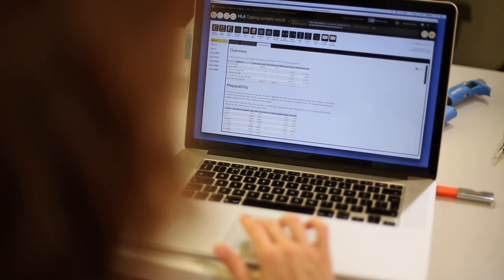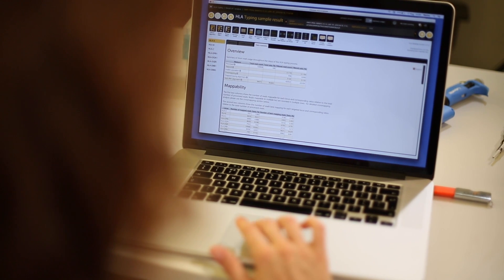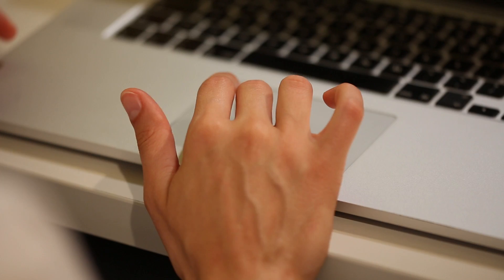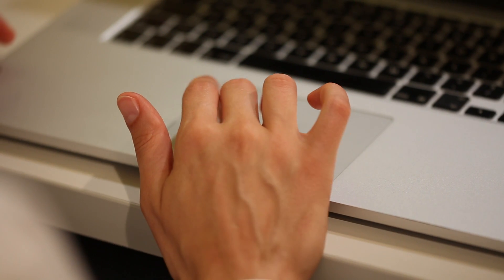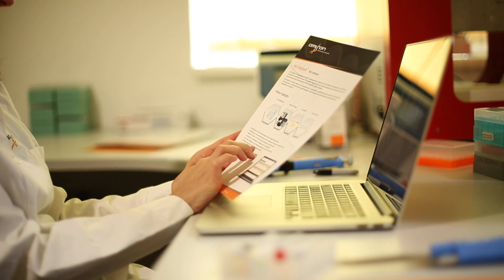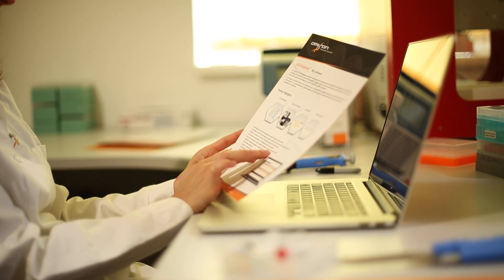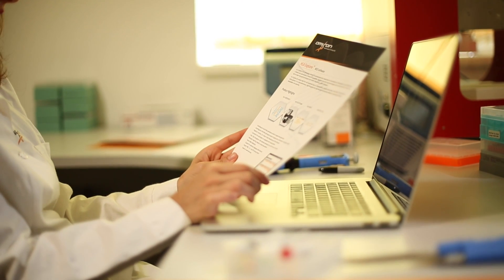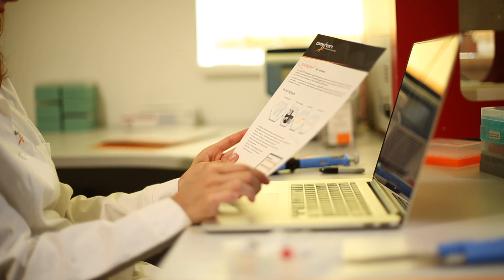With correct setup, HLA-Explore can be run without user intervention directly after sequencing, to power up your data analysis and improve your research experience.